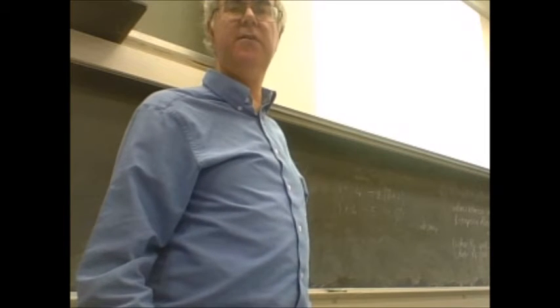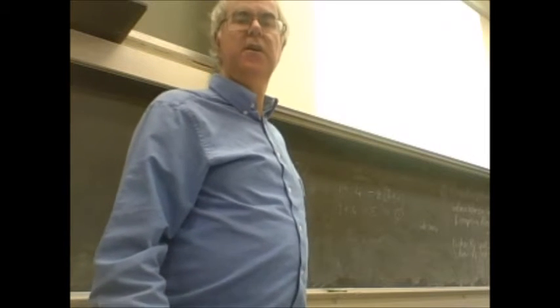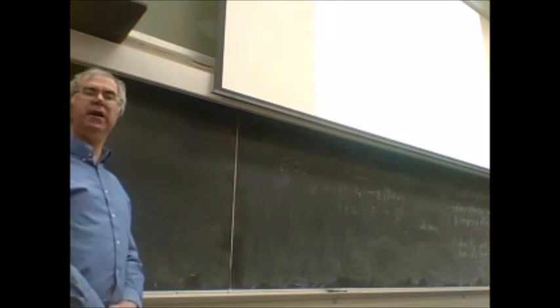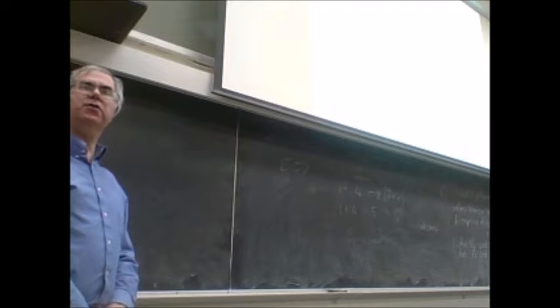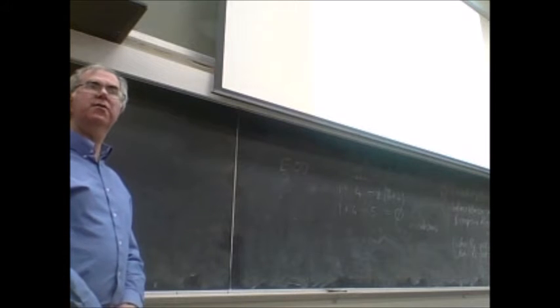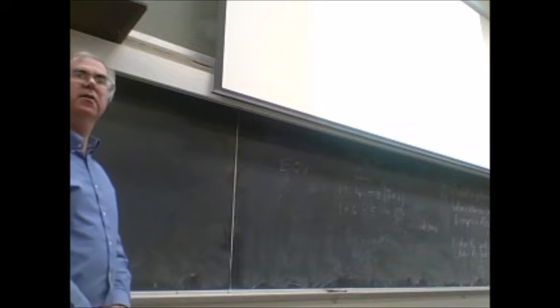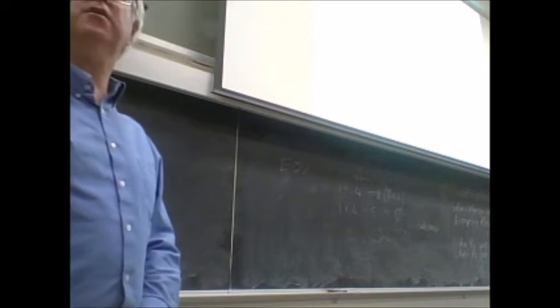All right, well, this is the first unknown. So the integration ratio for the hydrogens is 1 to 2 to 2 to 3. We have 8 hydrogens in all. So if the ratio is 1 to 2 to 2 to 3, that means it corresponds to 1H, 2H, 2H, and 3H.